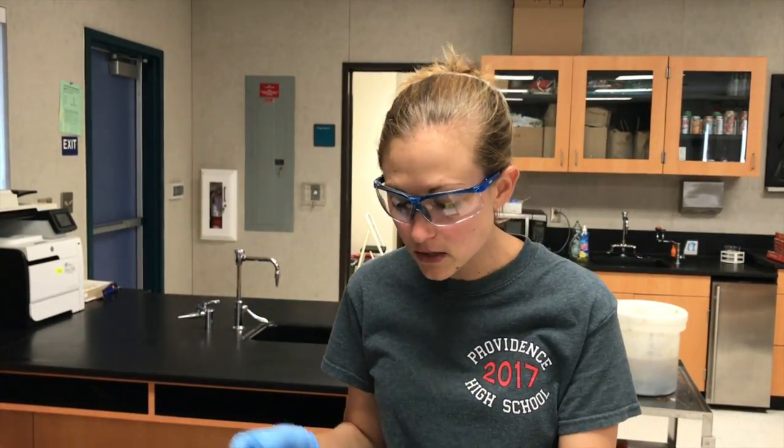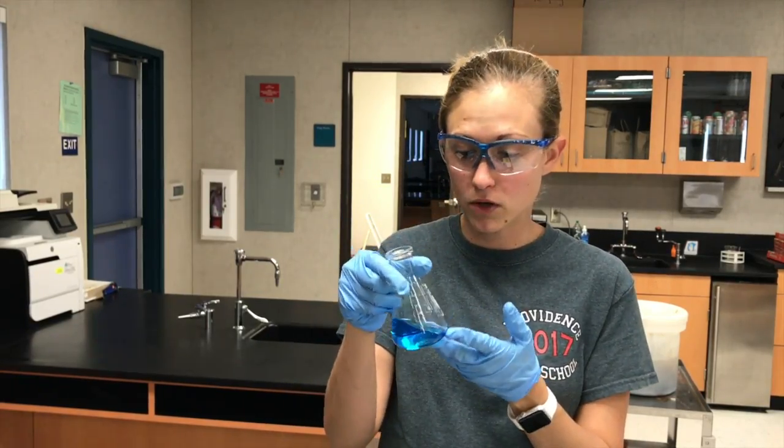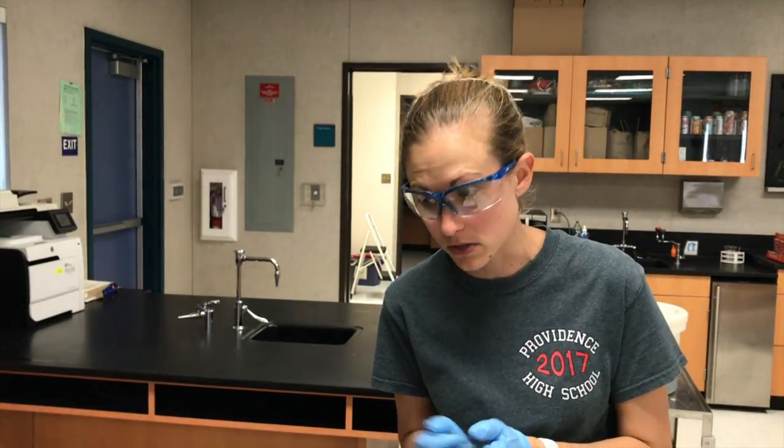Well, in order to do that, we need 5 different solutions with different concentrations. So we have one solution already. It's 0.4 molar copper nitrate, and now we need to create the other 4 solutions. So I'm going to show you how I created the 0.2 molar solution.